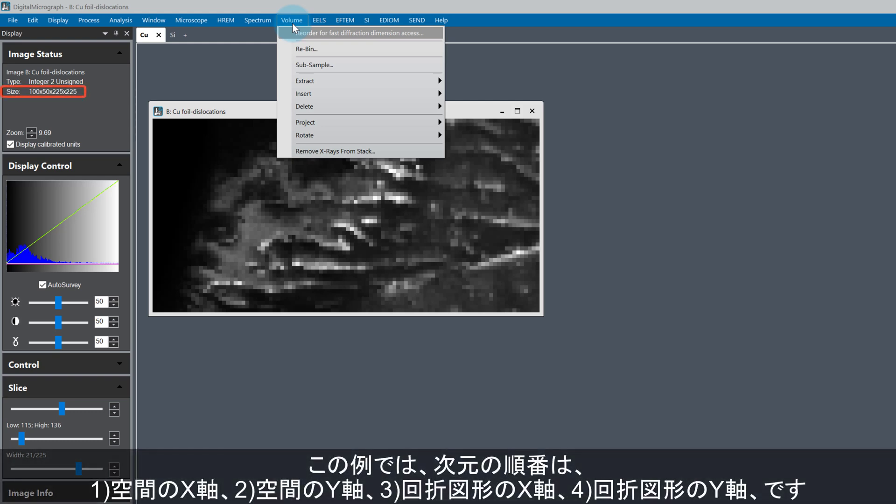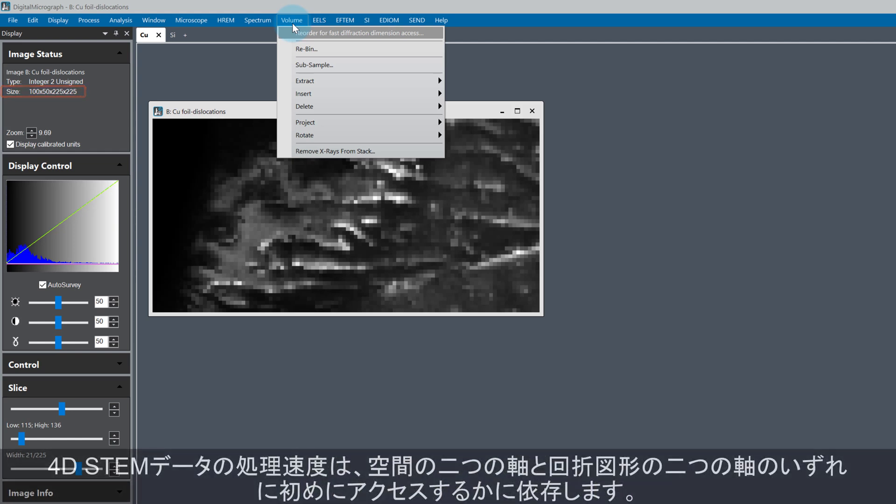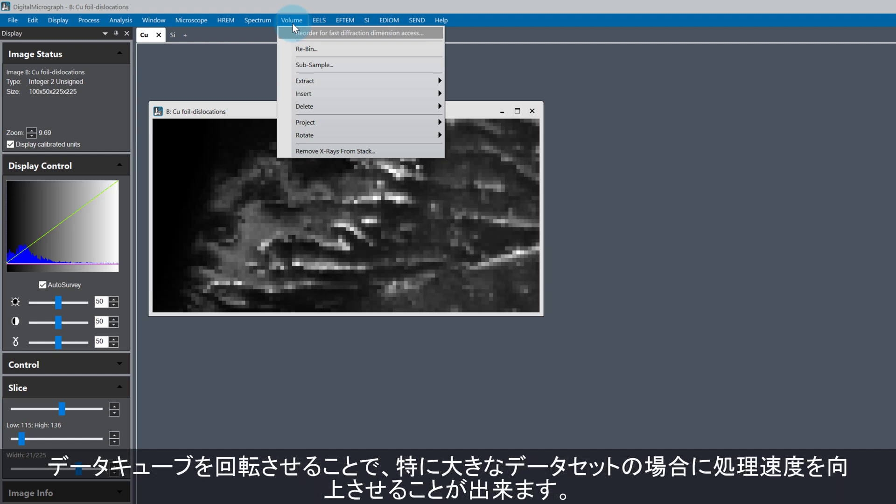In the example I'm showing here, the dimension ordering goes as spatial X, spatial Y, diffraction X, and finally diffraction Y. Certain processing operations are faster if the spatial dimensions come first, and others are faster if the diffraction dimensions come first. Applying cube rotation can greatly affect the speed of data processing, especially for large datasets.